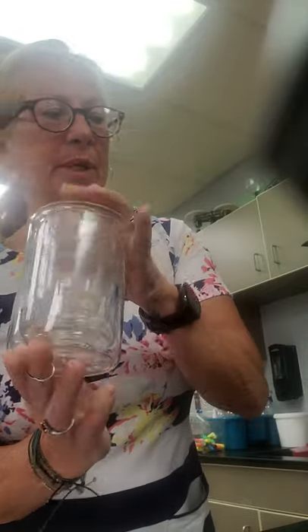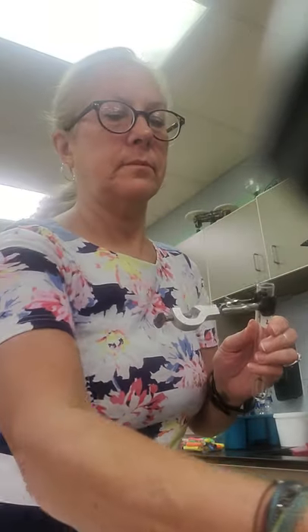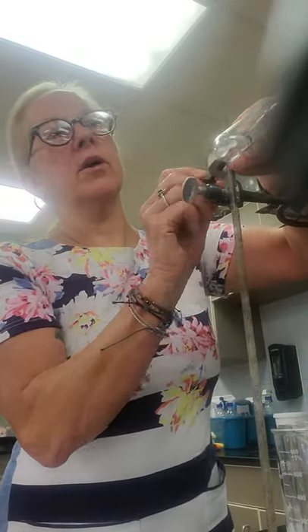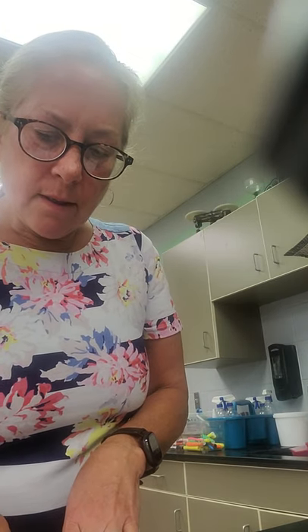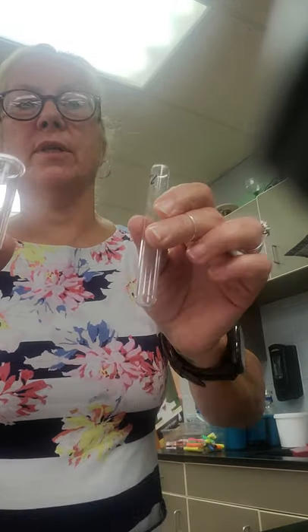Number fifteen is beakers — you have six different sizes of beakers in your cupboards. Number sixteen is apron. Number seventeen is test tube rack. Number eighteen is stir rod. Number nineteen: for holding test tubes, this is a test tube clamp — it goes on your ring stand.